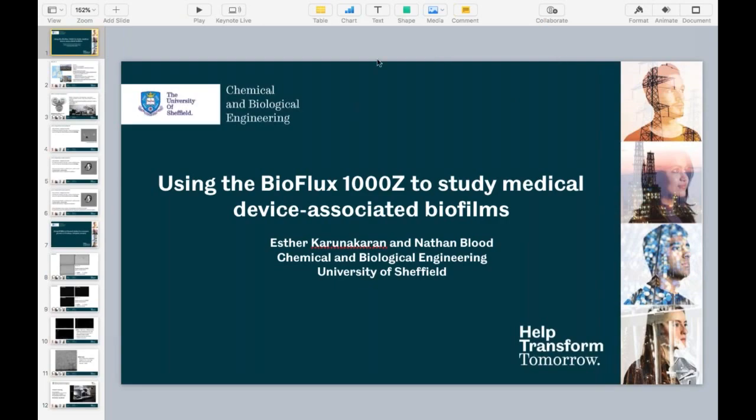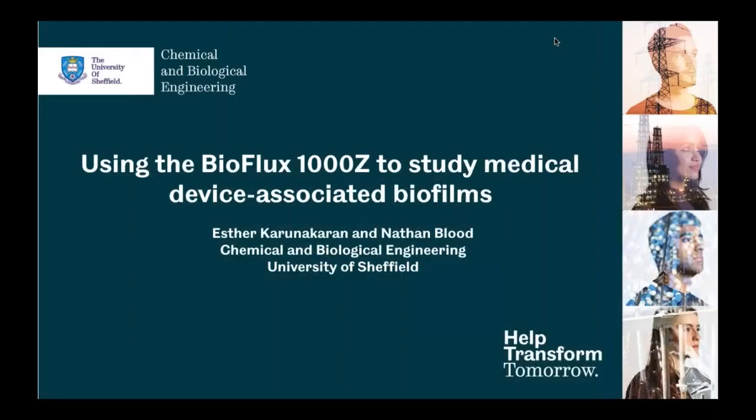Hello, everyone. Thank you for attending the webinar today. Thank you also to Brian Haynes from Fluxion Biosciences and Andrew Ridley from LabTech, the UK distributor for BioFlux, for inviting us to present this webinar. Today, I hope to share with you an overview of how we are using the BioFlux 1000Z platform for studying medical device-associated biofilms. First, I'll present an overview of the research in my group and within SCARAB, which is the Sheffield Centre for Antimicrobial Resistance and Biofilms. And later on in the presentation, you'll hear from Nathan Blood, who's doing a PhD investigating the formation of Proteus mirabilis biofilms in urinary catheters using the BioFlux 1000Z.